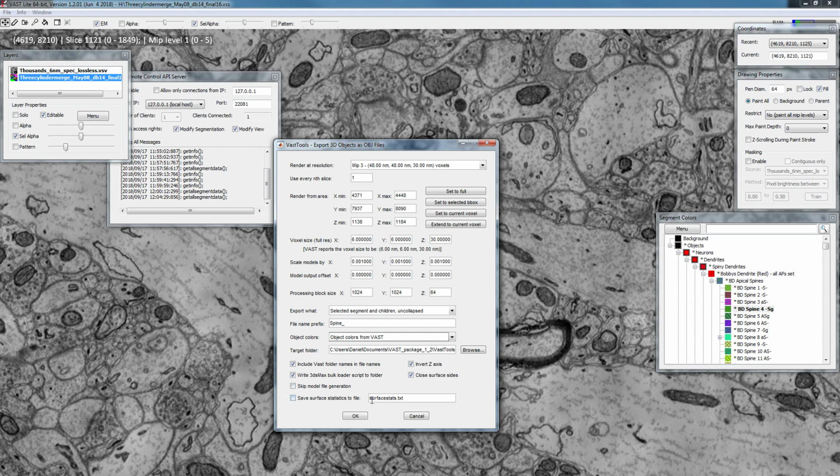That is a little bit limited in accuracy, just because the objects can be rather rough because they are generated from voxels. So the surface that you may get out of this can be overestimated compared to the actual biological object. So just keep that in mind if you want to use this function.